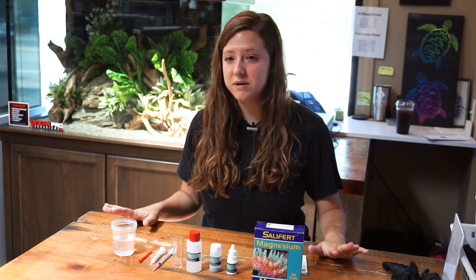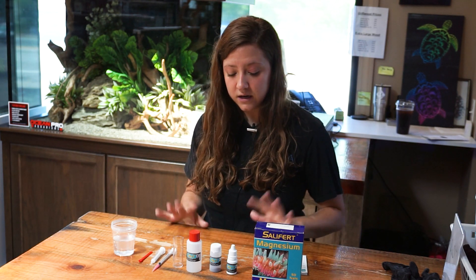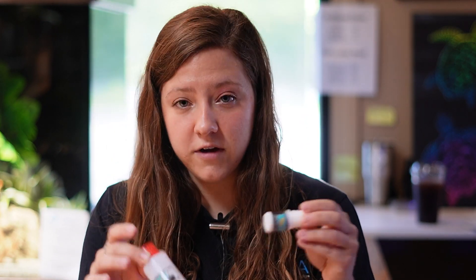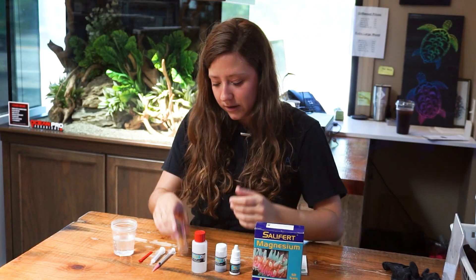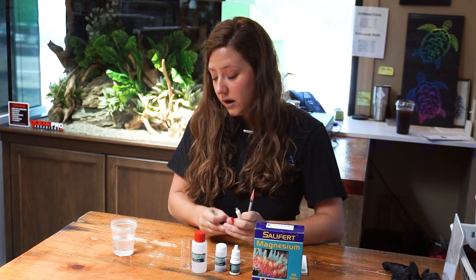When purchasing any test kit, you want to make sure that you have absolutely everything that it comes with before you get started. So we've got our three reagents — two liquid and one powder. We've got a little plastic cylinder, two different types of syringes, a little scoop, and we also have a water sample from one of the saltwater tanks in the store.